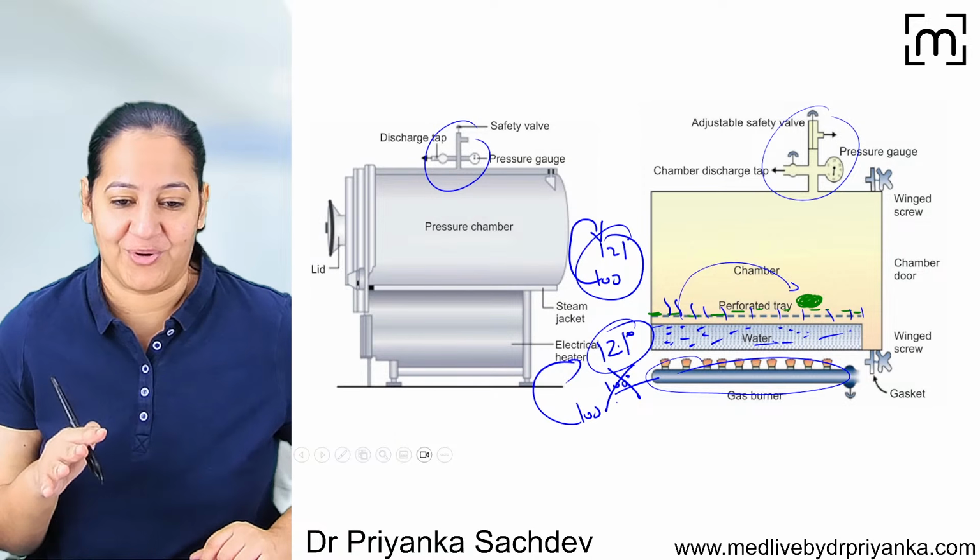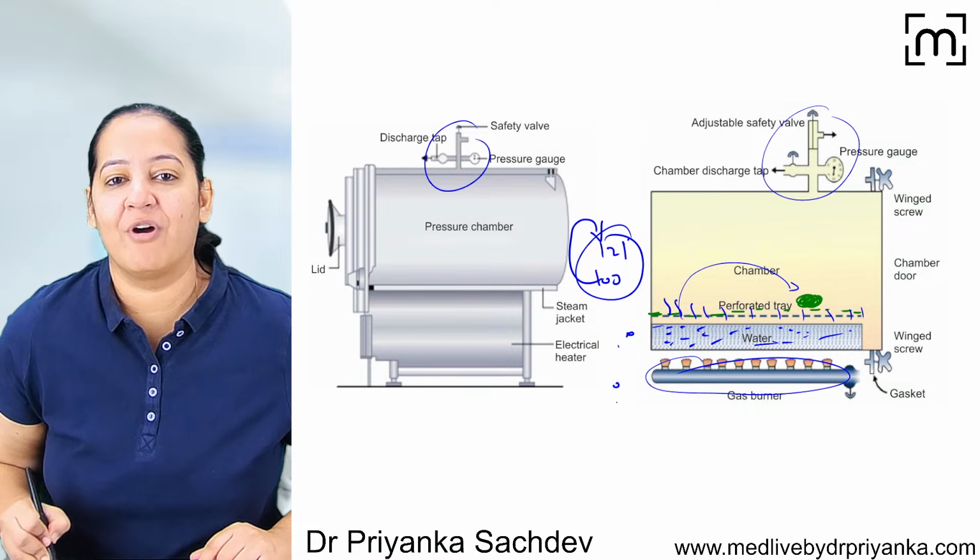So autoclave is a pressure cooker. We are giving pressure in that. So can you see the diagram, what exactly we are doing?